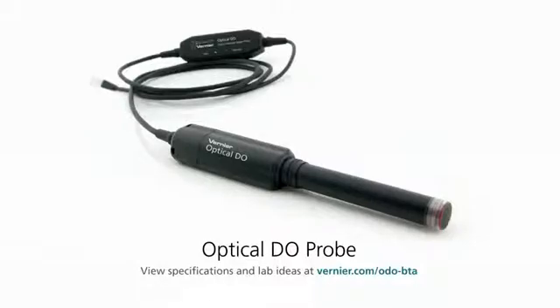Let's take a closer look at the optical DO probe. The Vernier optical DO probe can be used to measure the concentration of dissolved oxygen in water samples tested in the field or in the laboratory.